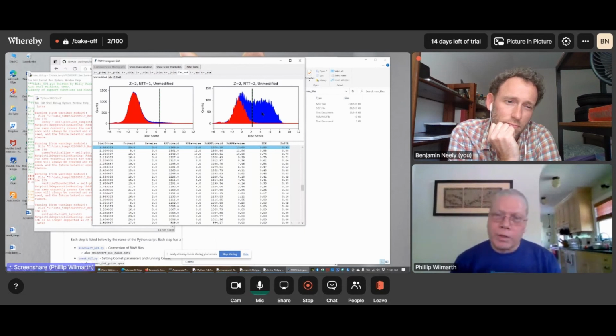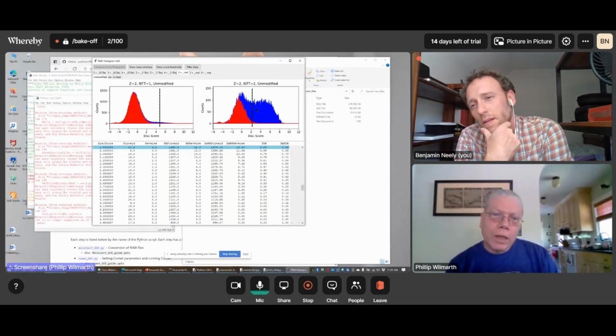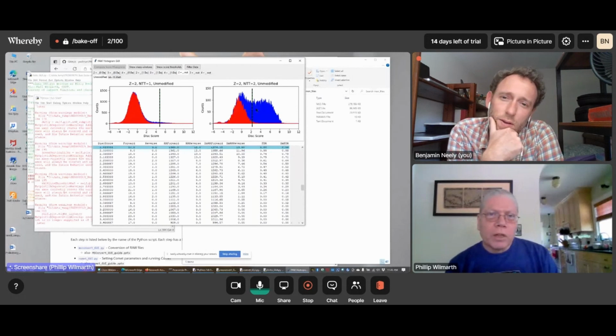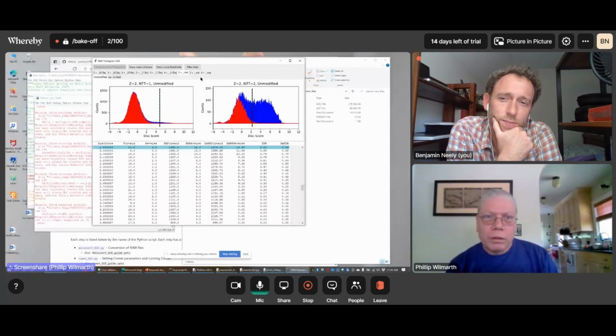But if you went and looked in the survey scan for this, it may not be anything that looks recognizable as a peptide. It might just be a single spike above the noise level that the instrument triggered on. And that happens with dynamic exclusion when you start working down at the noise level. So that's where these IDs come from. Whether or not they're going to be particularly interesting from a quantitative standpoint is another question. But you can recover some additional IDs from these that are outside the windows. And you never find them with something like a 20 ppm search because they don't have an accurate mass.